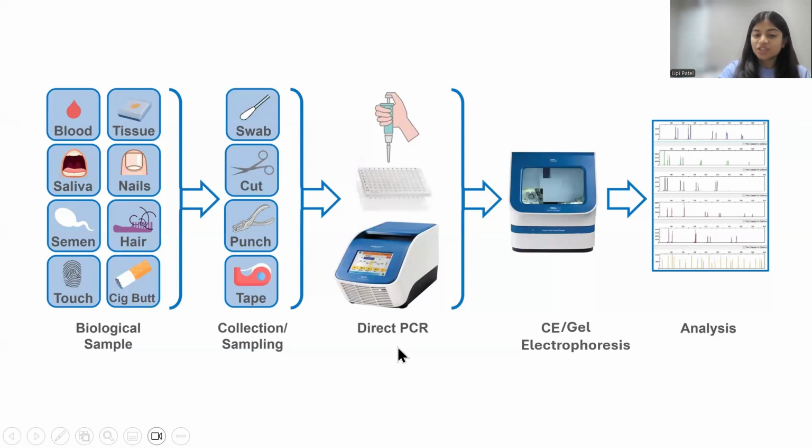So PCR is polymerase chain reaction, and it's basically amplifying or multiplying the small segment. So it's a small DNA fragment multiplied by 30 or maybe 40 times, depending upon what you choose. So you'll have that many copies of that small strand of DNA. So you're amplifying that small strand so you can visualize it further.